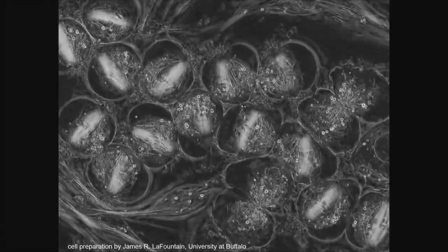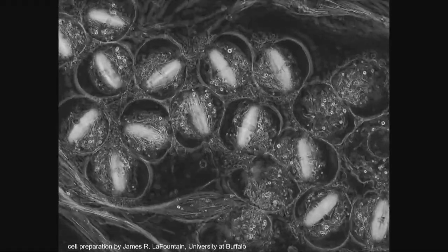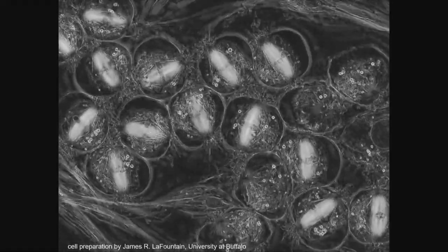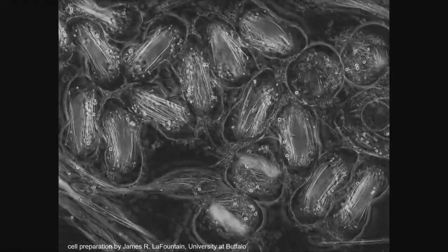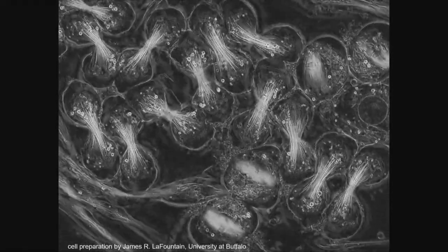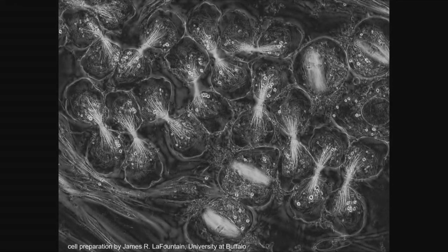So now you can see the spindles forming, the microtubules attaching, and then once it's completed. And these are all still to a large part a mystery, how this all works mechanically, from a signal point of view.